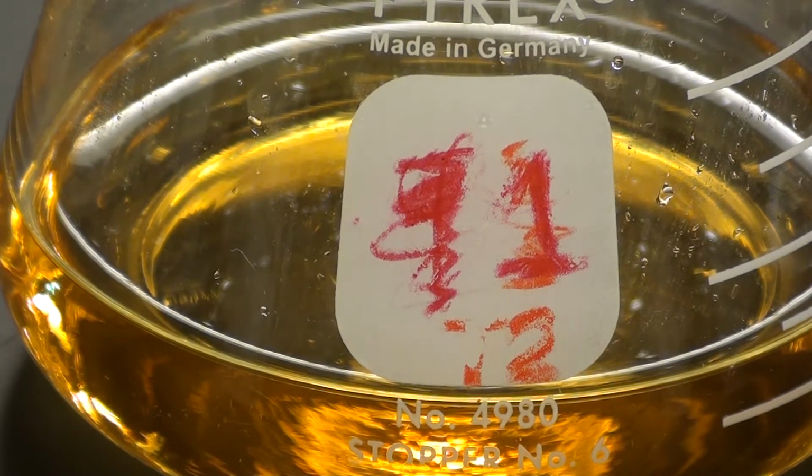Of course the times are going to vary depending upon the amounts of each thing that we have in the solution. Now within trials they should be pretty much the same, so trial 1 and trial 2 of the same experiment should produce similar times. I would recommend doing enough trials of a single experiment so that you get 2 within 10 seconds of each other. The other thing that's going to be important is to make sure that you take your solutions from the same bottles for the entire time.